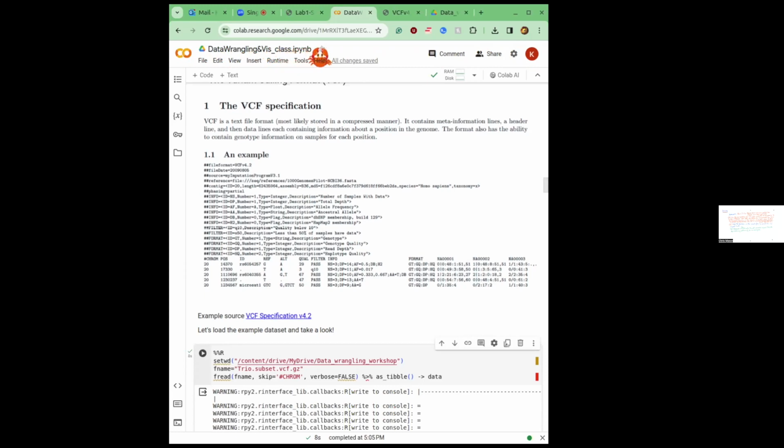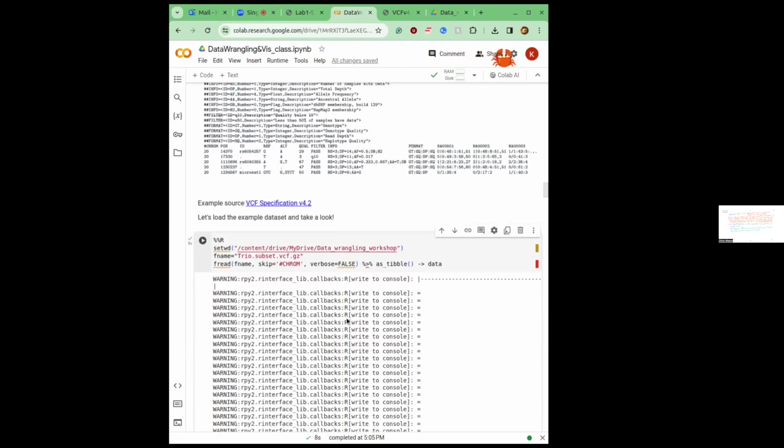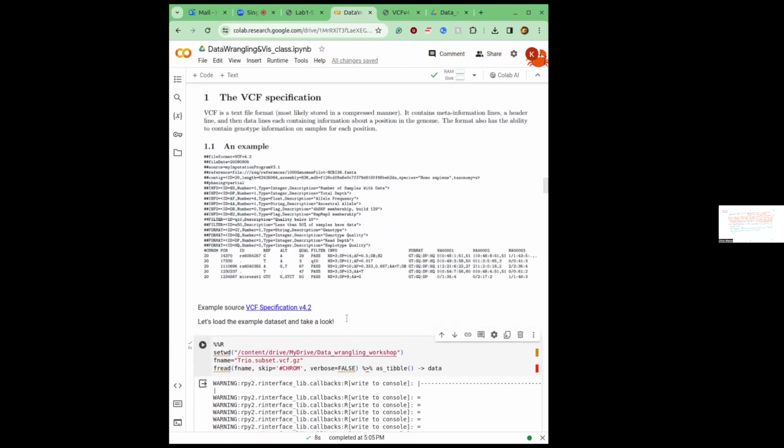So yeah, but it really depends, at the end of the day, and that's why this is a longer story for another lecture, on how that base calling algorithm works, what the raw data is that it's trained on, and then understanding its generalizability. But at some point, you will hopefully arrive at this level. So you will have the VCF file, right?